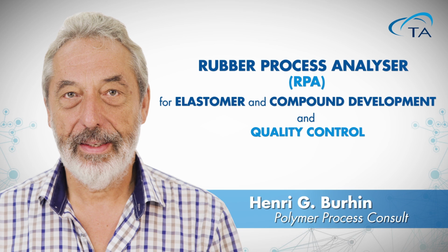Okay. Our next question is about instrument selection. Can you comment on the advantages or the differences between using, say, an RPA versus an ARES for running LAOS analysis? Well, my experience is very simple, especially with highly elastic materials such as rubber.